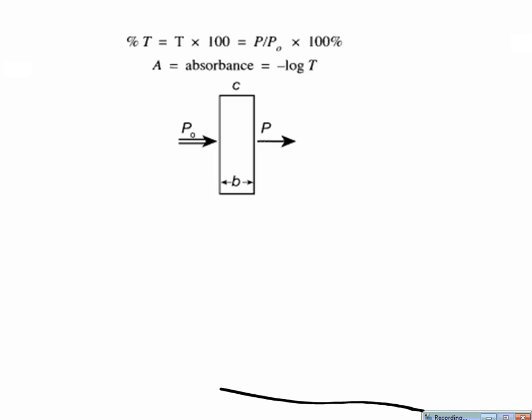Alright, so the purpose of this is to go over the objective of the lab for tomorrow, the calculations that you need to do pre-lab, and how you need to prep your notebook. First and foremost, we're going to be using a spectrophotometer tomorrow in class.